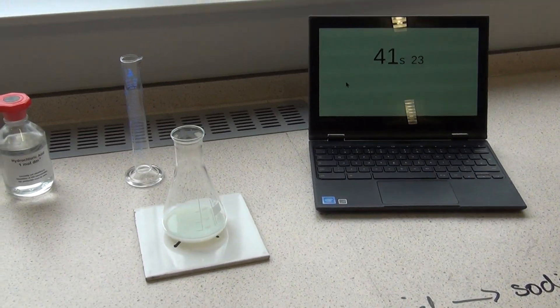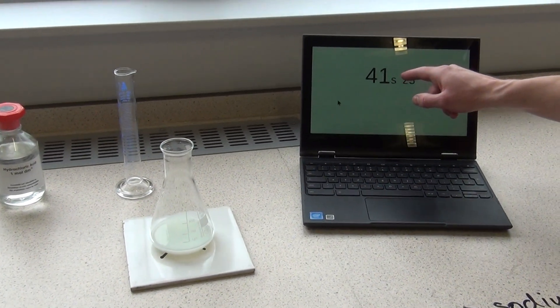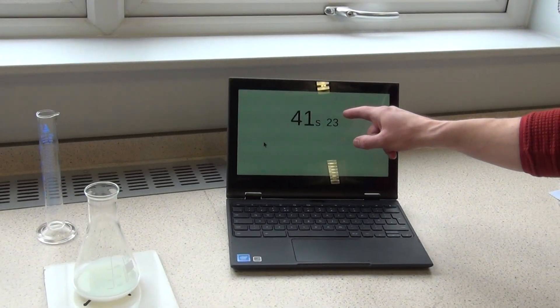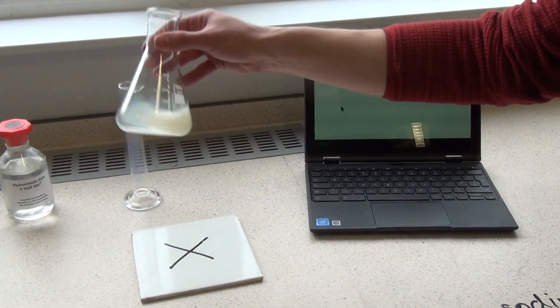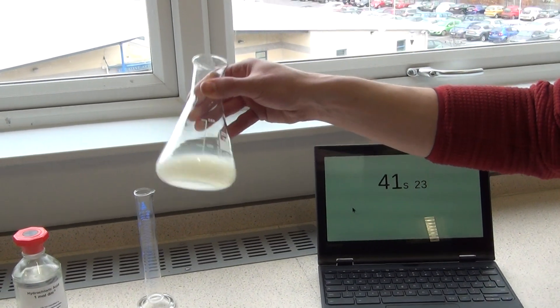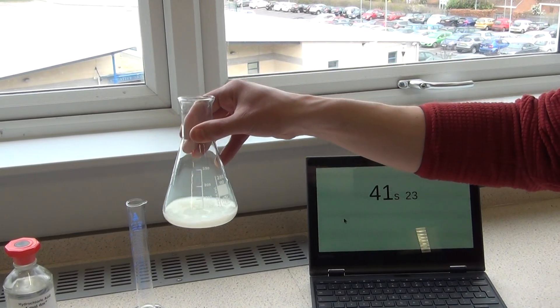So we can say that the shorter this time is, the faster the rate of reaction, because this cloudy precipitate would have formed quicker if the time taken to block out the cross is lower.